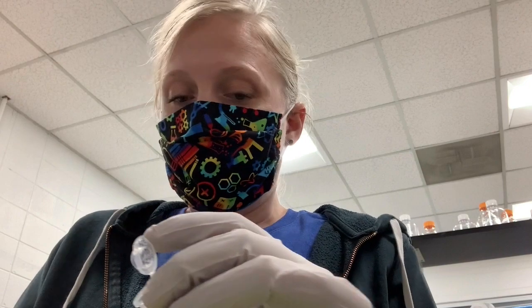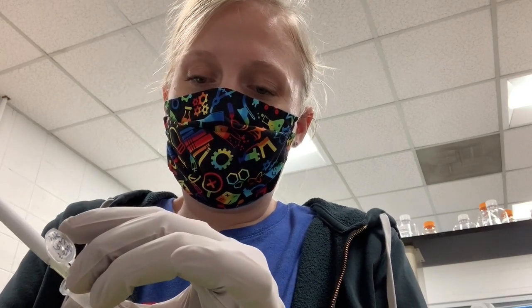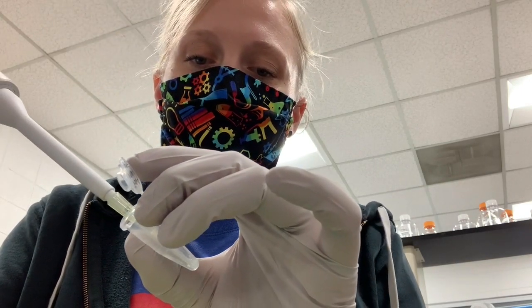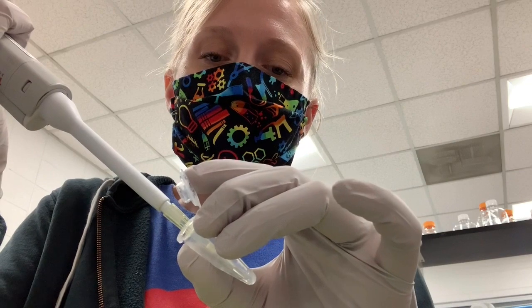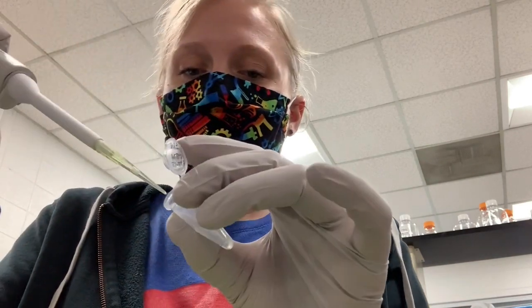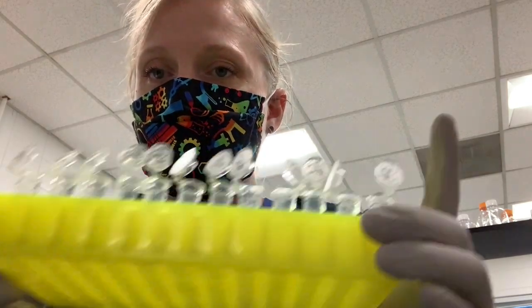So I'm going to finish removing the liquid, and I'm just eyeballing whether I need to use the P20 or the P10. You should see the liquid go up into the pipette, and then there's a bubble because there's no more liquid for the pipette to remove. I'm putting the tip down to the bottom of the tube, but beside the pellet. So the pellet is kind of angled, and I'm putting this on the bottom of the tube, but on the side away from the pellet. And with these tiny tips, and if the pellets are this big, you probably won't be able to suck them up anyway.